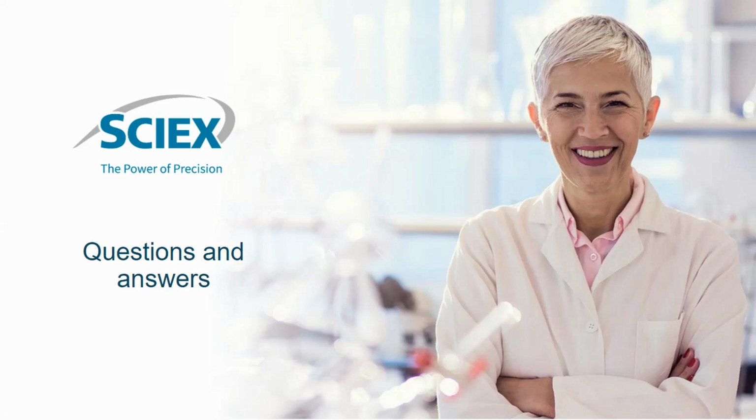Another key thing is in regards to chemistry. The more we know and better understand the different modalities of protein and gene medicine therapeutics that are out there, the more we can do to help relieve that burden on the data analysis side. One of the things that we've done for the BioPhase is take a look at fast glycan analysis.